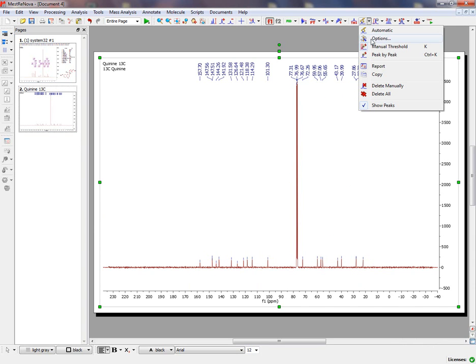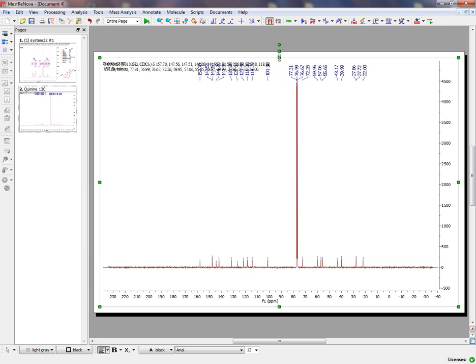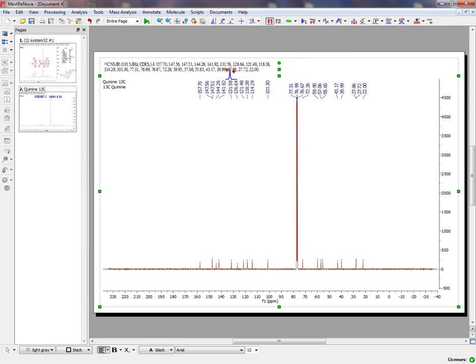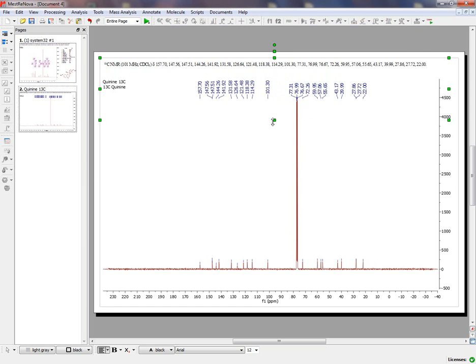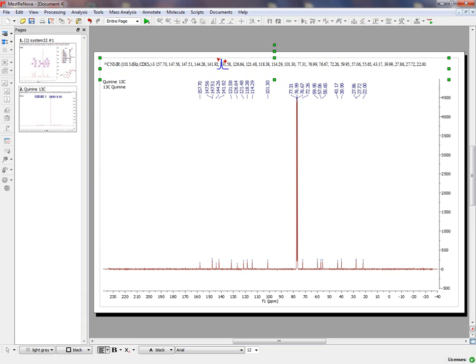Here we can show also a Peak Report just by clicking on the Report icon, and you will get the Peak List of your Carbon NMR Spectrum.